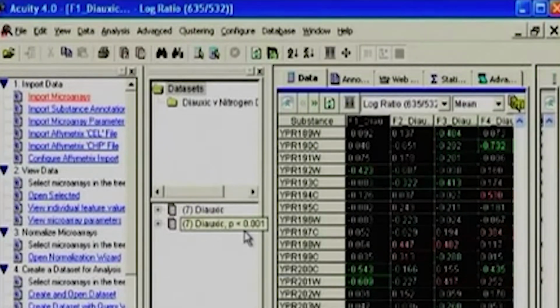Now there are two ways of doing things in the data set. One is to take all the features, and sometimes people say I want to define my criteria such that my visualization makes more sense to me. So maybe one can be stringent at this stage itself and say, I want only very, very biologically significant ones. Define the p-values and then sort the data based on that. People can choose which changes go up and down within a range, which is twofold upregulated, twofold downregulated.